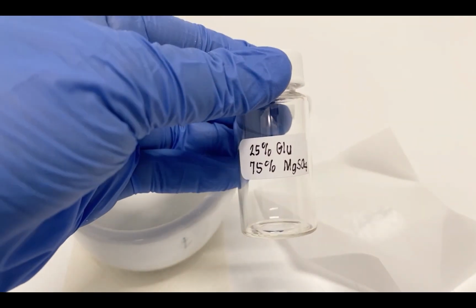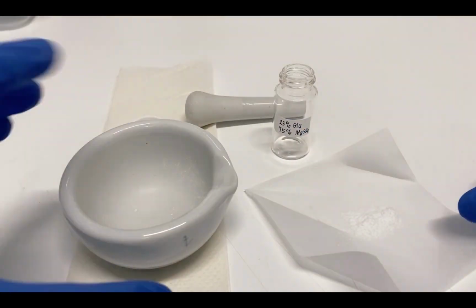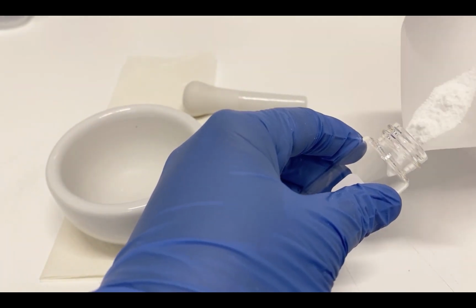Prepare your vial and properly label it with the identity of the mixture. Lastly, carefully transfer your triturated solid mixture into the vial and be careful not to spill it around.